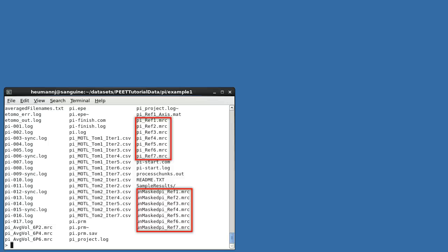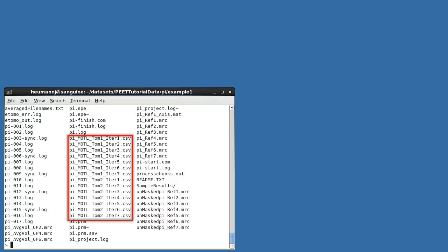The three averages we requested are in MRC files tagged AVG vol, and with the suffix indicating the iteration number and the number of particles averaged. References, both before and after masking, are also saved in MRC files, with a ref tag and a suffix indicating the iteration at which the reference would have been used. Notice that since we performed six alignment iterations, the final output has a suffix of seven. Similarly, motive lists for each volume and iteration are saved in CSV format. Once again, the suffix refers to the iteration at which they would have been used, not the iteration at which they were created.